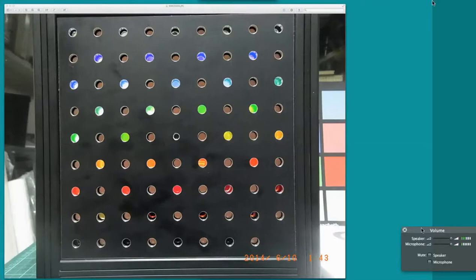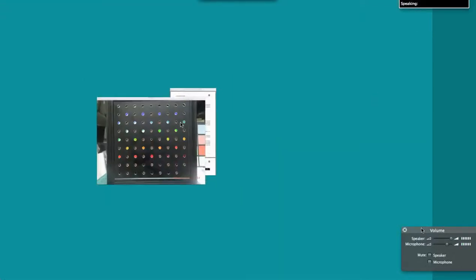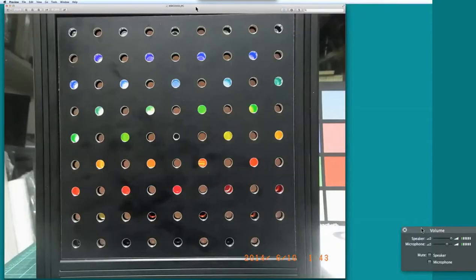Any other questions? No question. Okay, good. So then, please give it a try. Remove the plate, capture the images, analyze the images, and let us know if everything worked well.